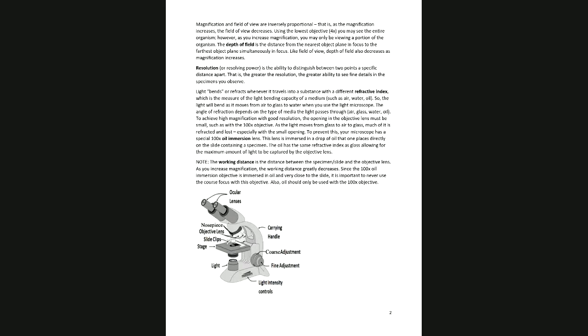So high dry should never have oil. You always have to clean it thoroughly. And even as you're using it, and we'll talk about this in a minute, you may accidentally get oil on the high dry lens. You always want to clean your lenses.